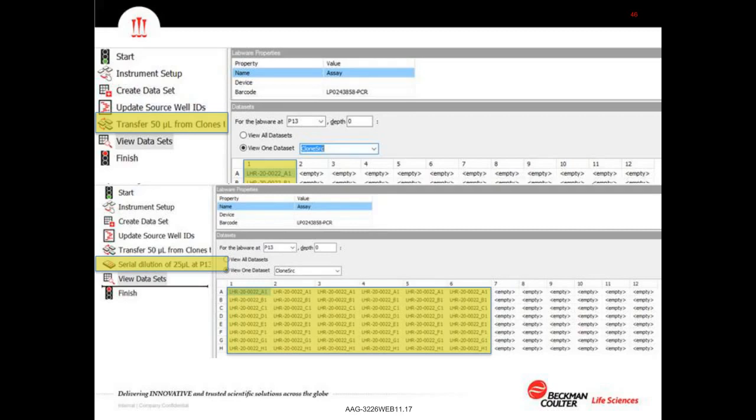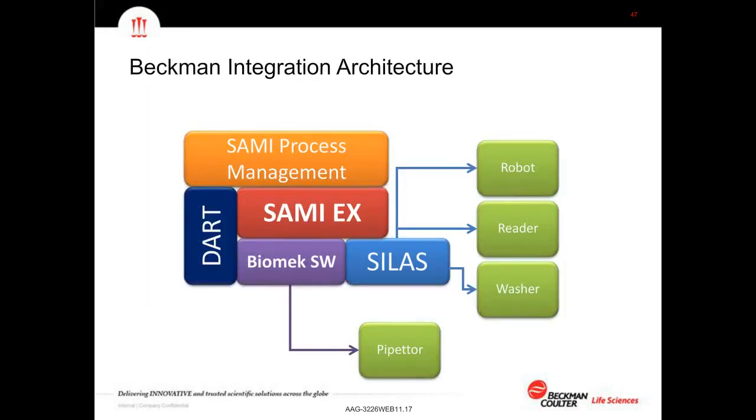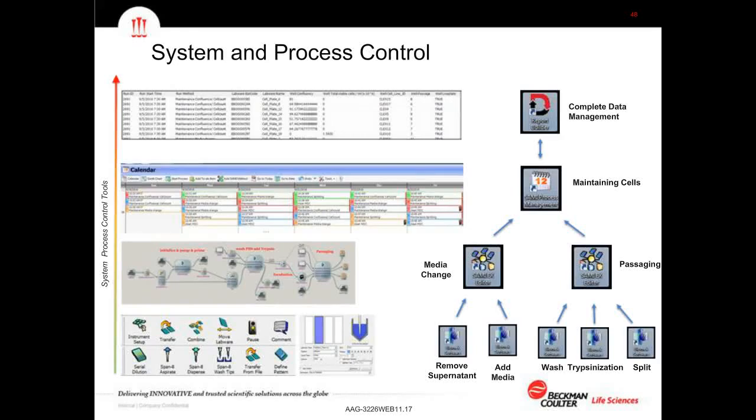So now let's turn the corner just a little bit to start to look at how we bring information into the system. In the end, you're going to target some sort of plate reader in order to bring information in. Our software all hinges through our Silas technology in the blue square. As we look at the different layers, this is again repeated from Russell's talk, where we have different pieces of software that come into play depending on the complexity of the system and the length of the workflow. But we will use these different pieces together in order to get our results.